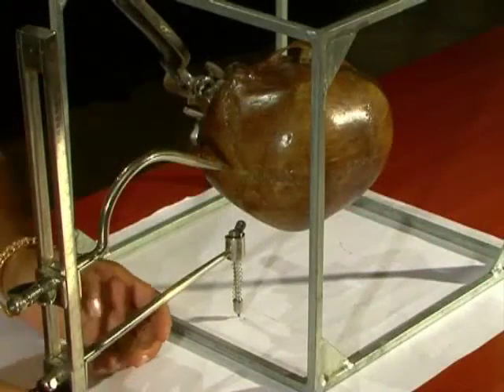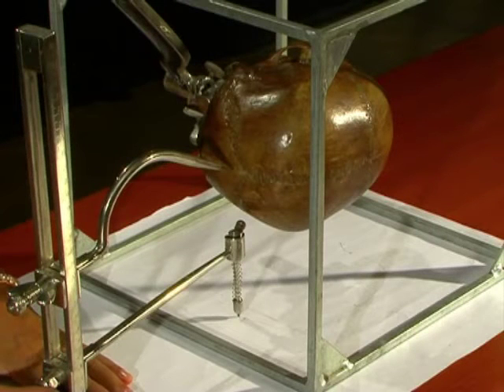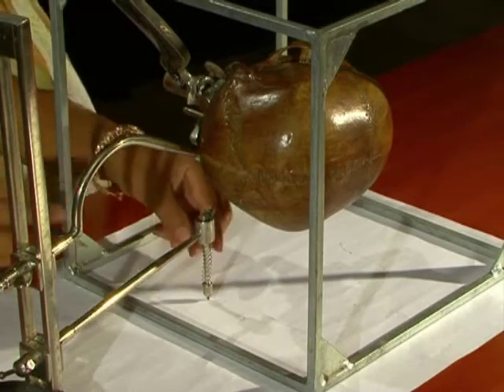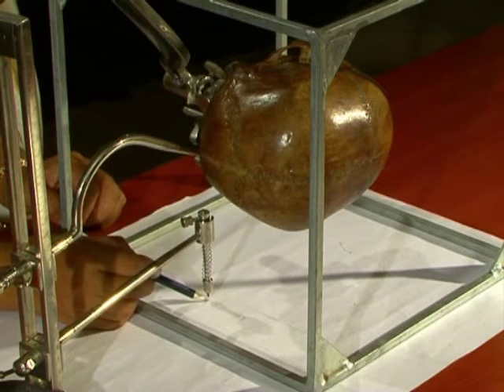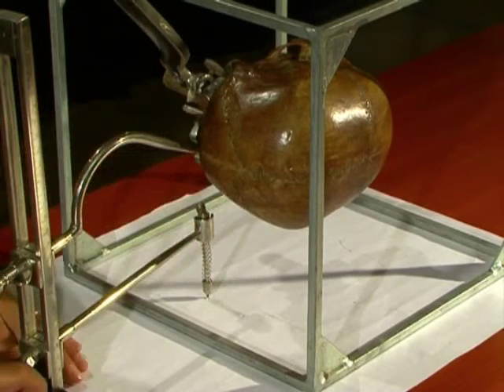On the important landmarks, a slight pressure is applied on the pencil tip, or using another pencil, it should be marked with a cross on the curve so as to make it easily identifiable when the lines are to be joined between the two important landmarks.